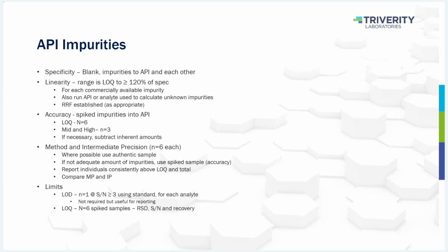And the same goes for the LOQ. For the LOQ, again, N of 6, spike samples, sometimes it has to be a standard, RSD, signal to noise, and recovery.